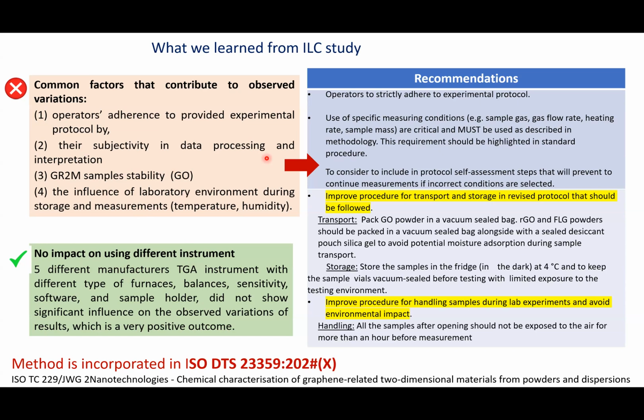So we included all these changes and optimized our protocol, and this protocol is now included in the new ISO standard, currently in the consultation stage, handled by Charles Clifford. This is a very nice story, starting when we started to explore this method.